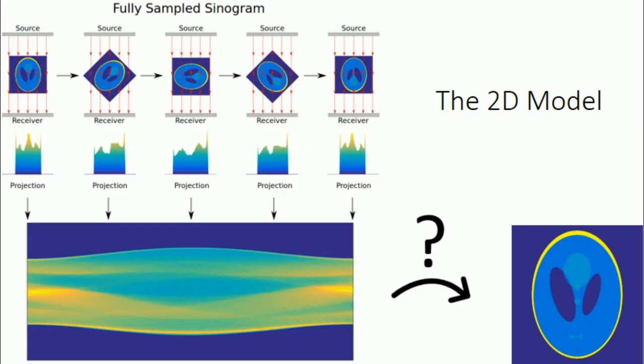So as I've just said, the difficult part is inverting 2D images to get 3D reconstructions. Unfortunately, these are quite difficult to draw as well, so I'm going to talk through the process of getting 2D reconstructions from a series of 1D images.